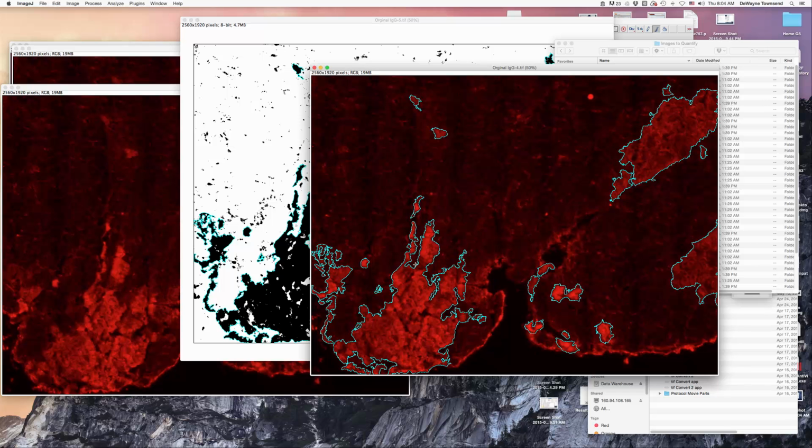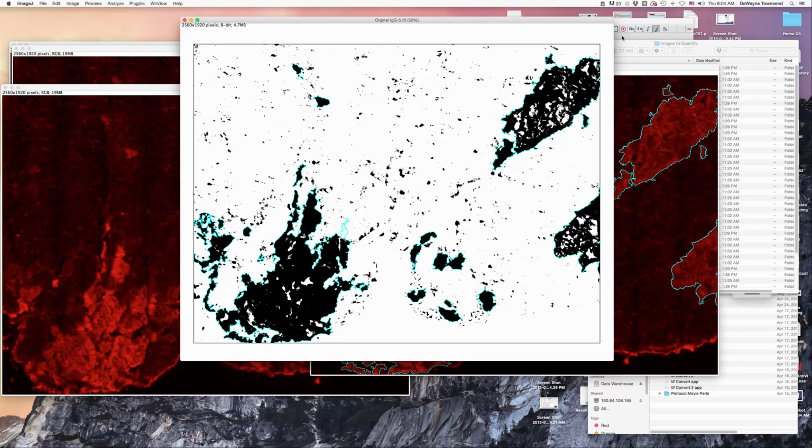You know, I might be tempted to sort of drag this off. Cut those, separate those. I'm going to go back to my smaller brush to do that though. Okay. So again, I'm going to basically draw a line through here saying, you know what, there's this negative region right in this area here, probably coming down a little bit like this. Something like that. Okay, so that's good.